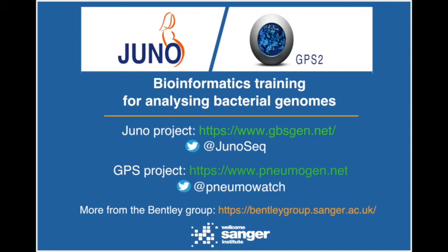Long branch attraction is a systematic error, where distantly related isolates may incorrectly cluster together on a tree even though they are not actually related. So when you have long branches in the tree, you have to pay attention to whether it is due to long branch attraction or whether they are real samples that cluster together.